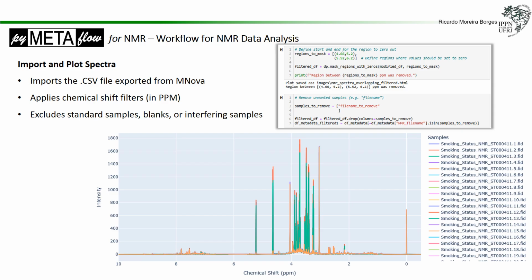And we make plots, some decent plots. All the plots are saved as HTML, so they are high resolution, and you can zoom and check for chemical shifts, and you can remove samples from the plot itself, or add samples to the plot. You can do all sorts of things, and then you can download the figure, the image as a PNG, right, for publication or documentation.